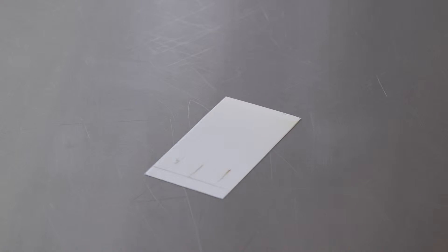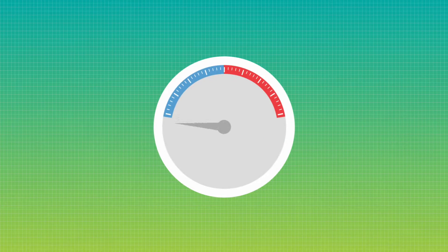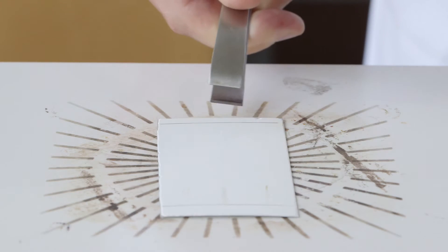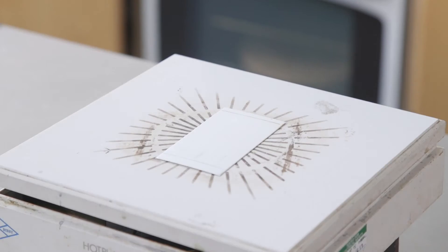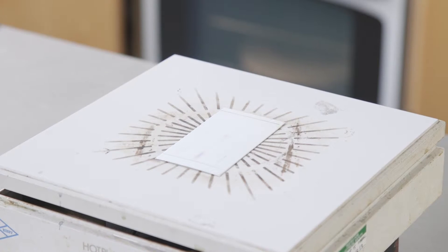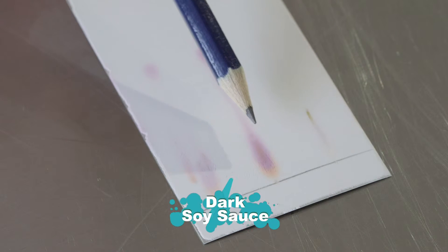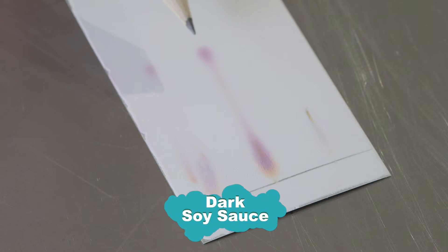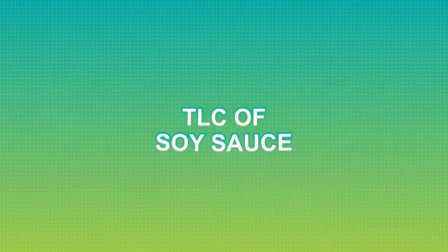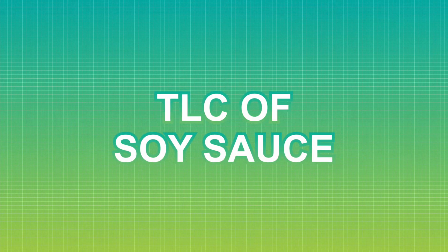You dip the plate into the solution. It is harmful, so this should be done in a fume cupboard. We let it dry again, but still there is nothing to be seen. This is because the reaction needs heat to work. We place the TLC plates on a hot plate at 60 to 70 degrees. You can now see that spots have appeared at different points on the TLC plate. Each spot represents a different amino acid.